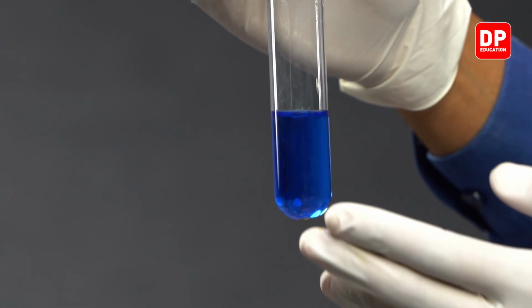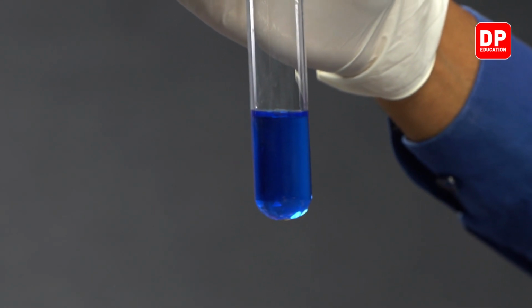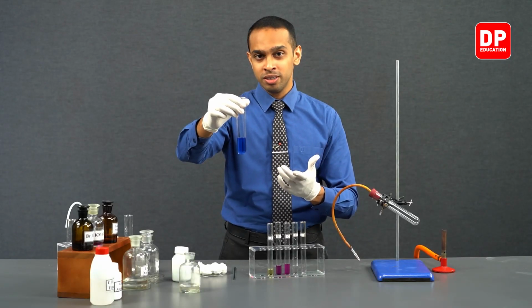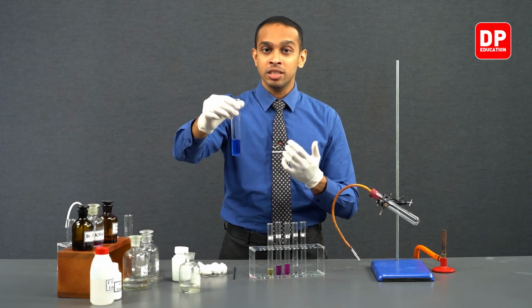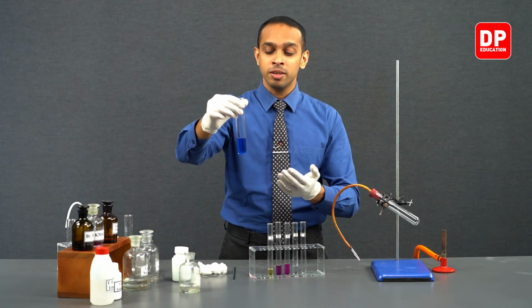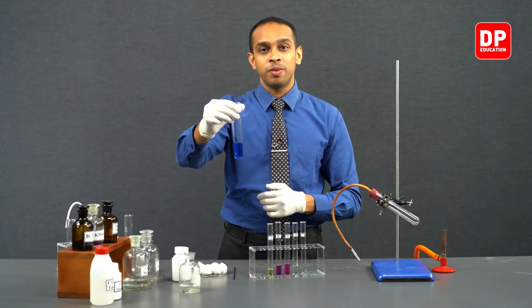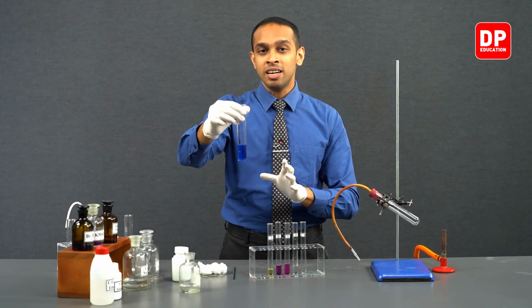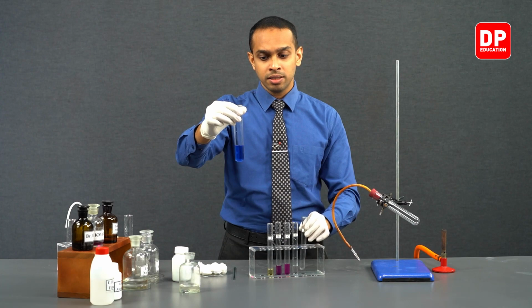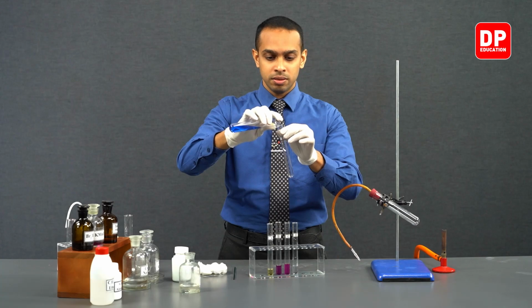Now students, we have dissolved all the cuprous chloride and formed ammoniacal cuprous chloride here. We initially dissolved the cuprous chloride in water. We saw some of the cuprous chloride solid didn't dissolve entirely in water, but after the addition of ammonia, all of it dissolved to produce our ammoniacal cuprous chloride that we have over here. So let's take this ammoniacal cuprous chloride solution into our test tube E.